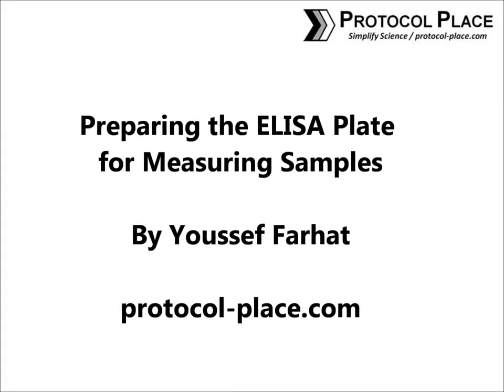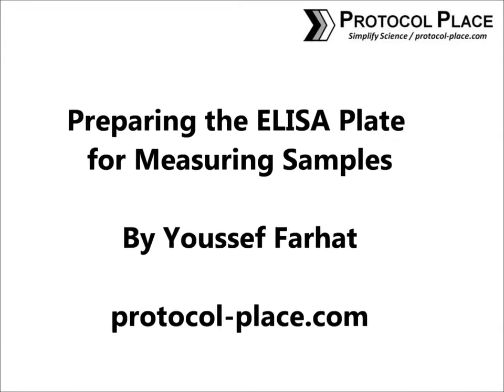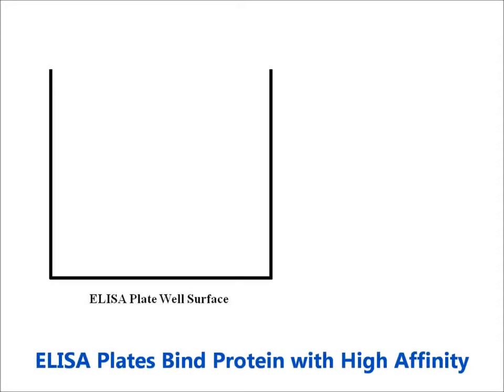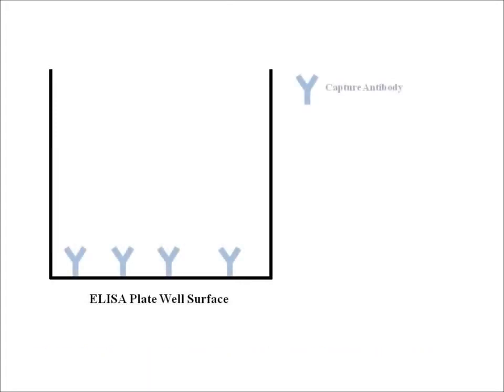Today we're going to talk about how to prepare the ELISA plate for samples. In order to really understand what's going on here, here's a little schematic. You're going to start with an empty plate, which is special because it binds proteins with high affinity. The first thing you're going to do is add a solution of capture antibodies to the empty wells of a 96 well plate. Over time, those antibodies are going to adhere to the surface of the plate, as shown here.